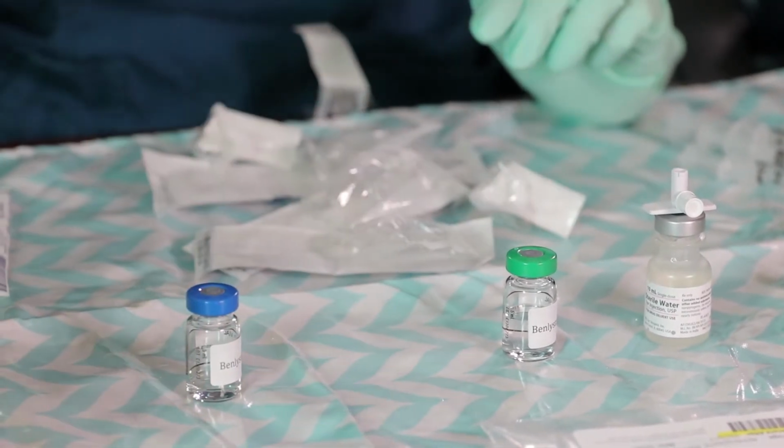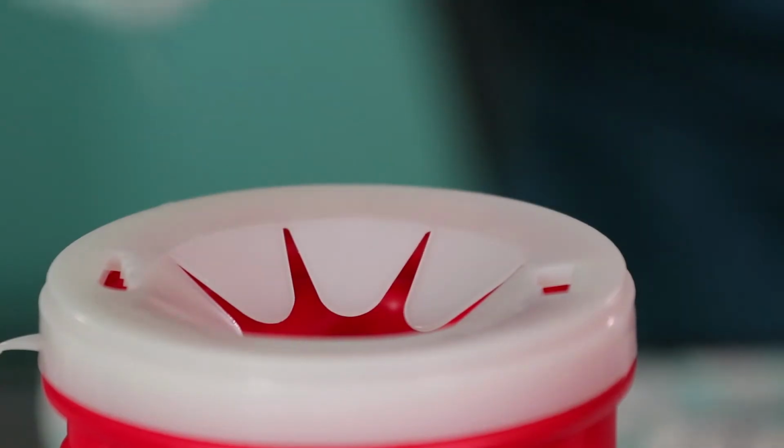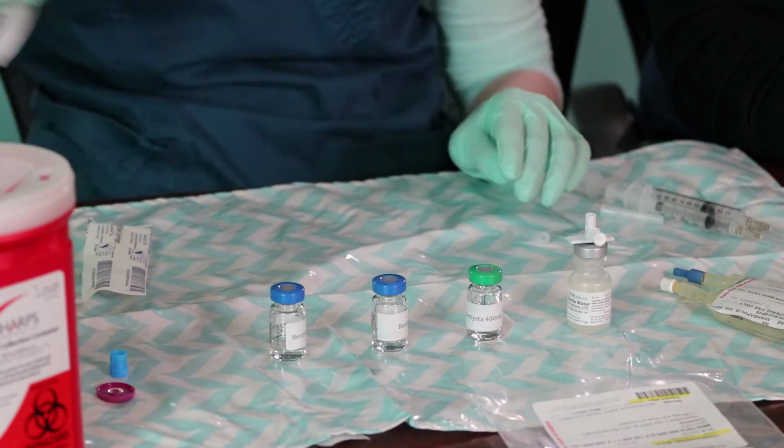Inspect the vial for cloudiness and clarity, following manufacturer drug-specific instructions. Whenever possible, avoid recapping needles and place directly into the sharps container. Remove any used supplies using the garbage bag sent along with the order.